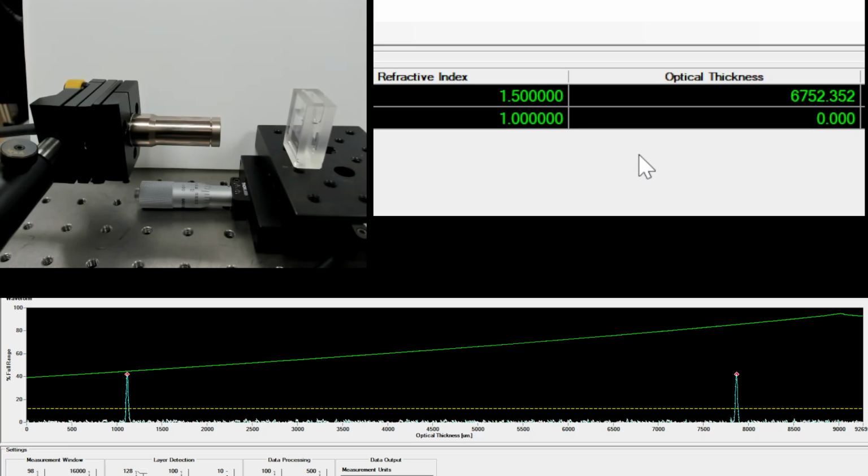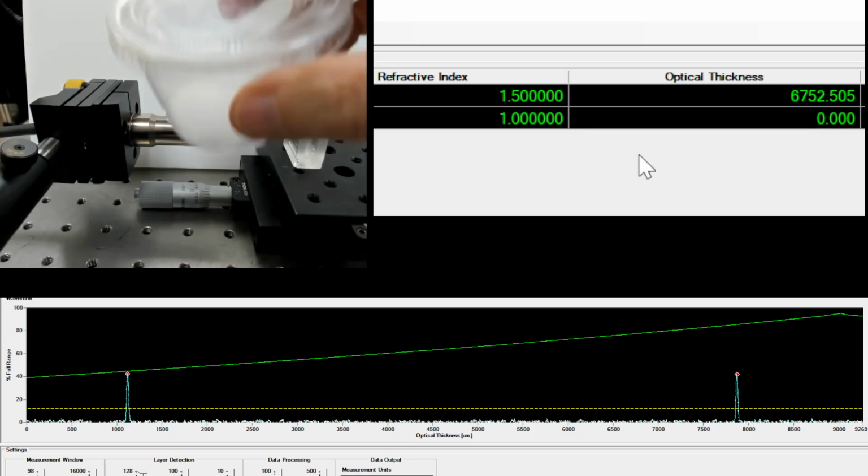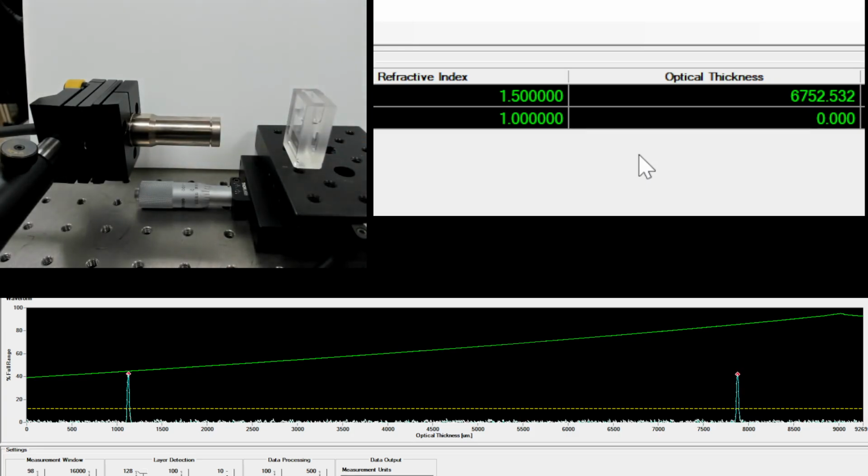What happens if you start to add salt to that? In fact, I have some sodium chloride, which is plain old table salt. And we're going to start just dropping it in, see if we start to see any changes in that thickness. So here we go, a little bit's going in. Ooh, a lot of it's going in. That's good. We'll look for a big change.